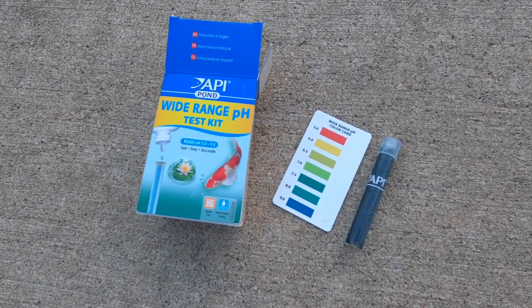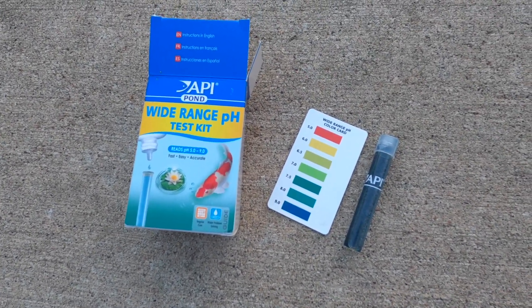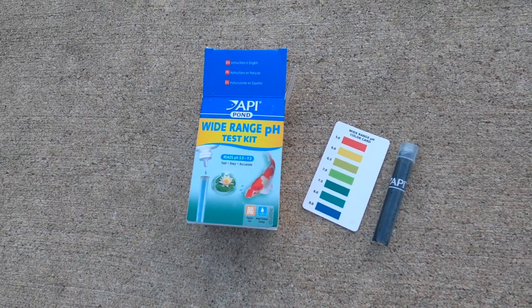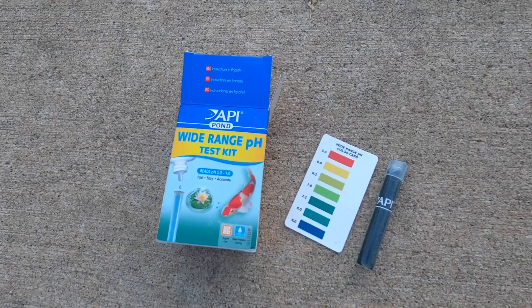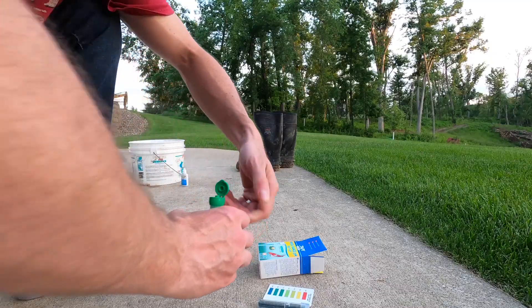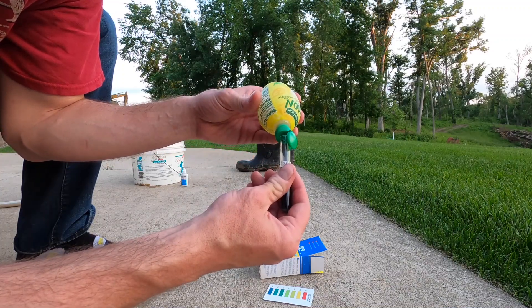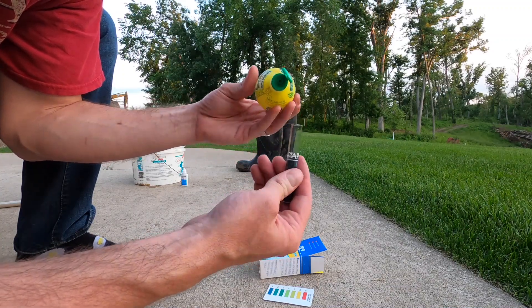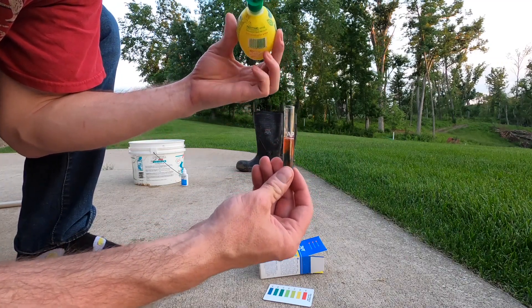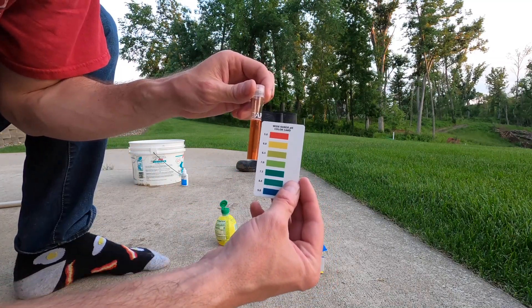So I took another test on a different side of the pond. This test produced roughly the same color. And so my wife, being as smart as she is, suggested, well, let's just make sure. She gave me some acidic lemon juice to verify the test. One drop of lemon juice turns it pretty red — five and a half, maybe.